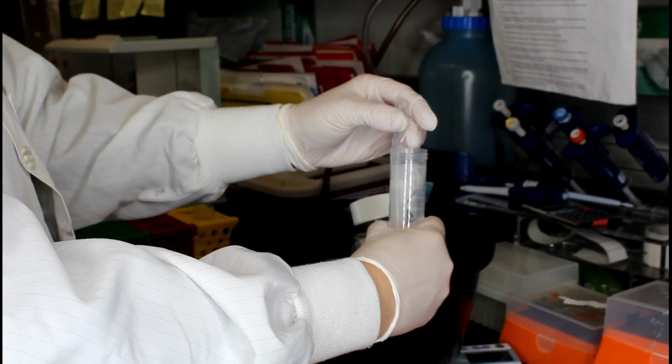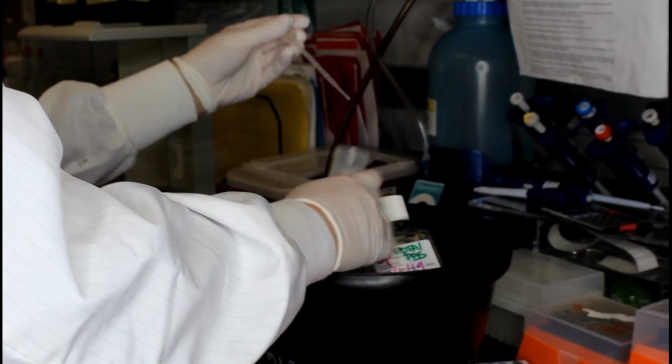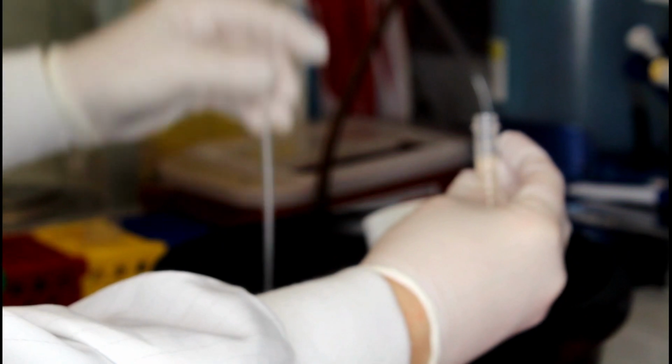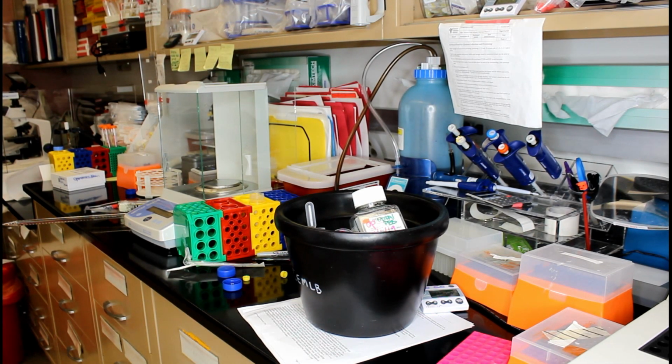Once the sample is removed from the centrifuge, the supernatant of that sample is removed and put into a separate test tube. That sample is stored at -80 degrees Celsius.